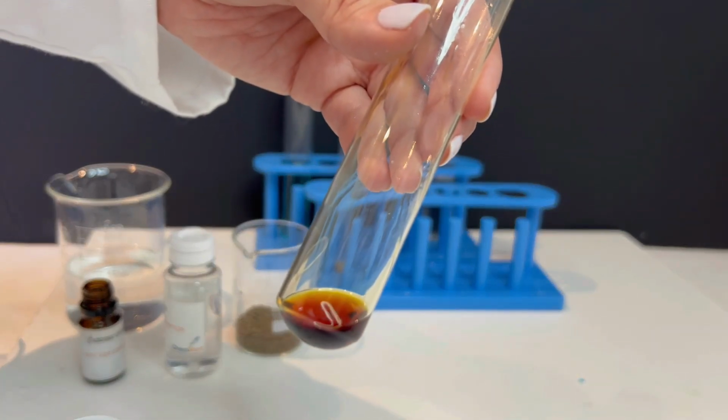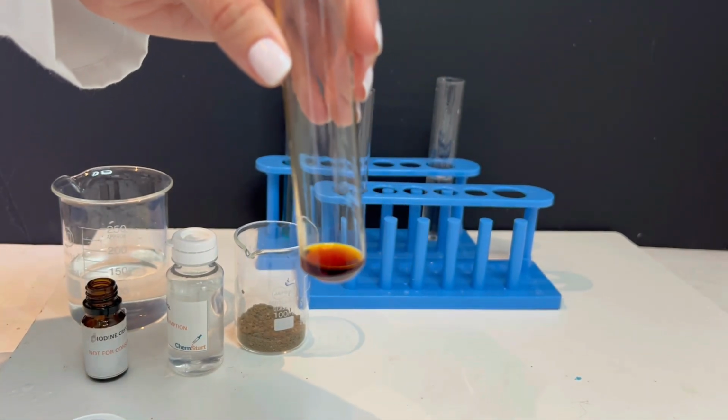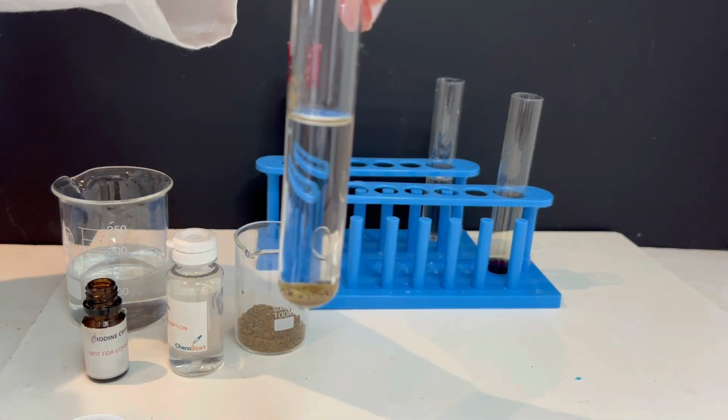Observe how the iodine dissolves completely, forming a clear, uniform solution. So this is a homogeneous mixture. Now, let's review each mixture to reinforce our understanding.